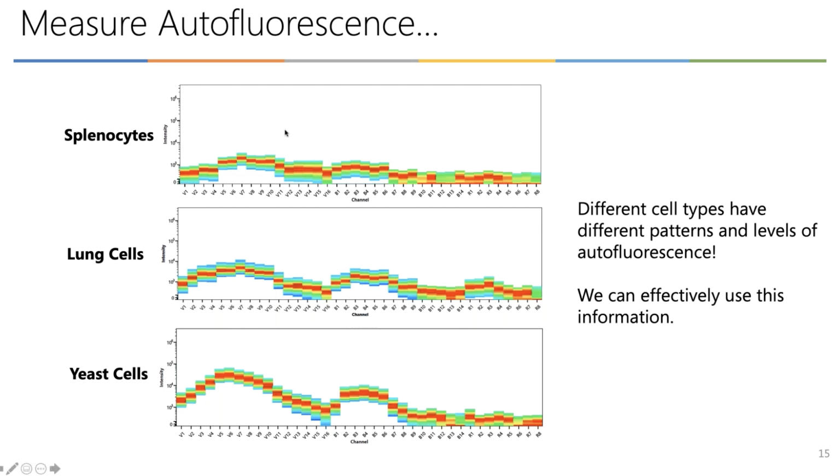of that particle. Here are various examples coming from different sites that we work closely in collaboration with, showing you that the level of autofluorescence and sometimes even the autofluorescence signature is different depending on the particles or sample types that you run in your lab. And we can use this information as part of the information to assess what is the information in your multicolor samples. What does that mean?